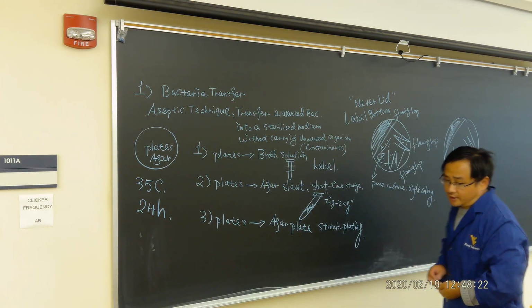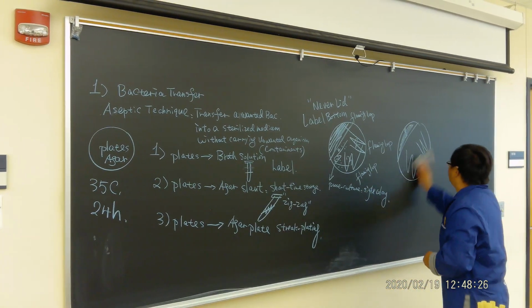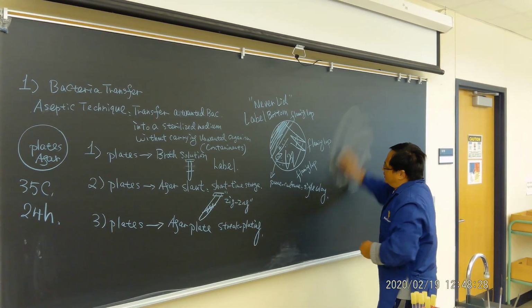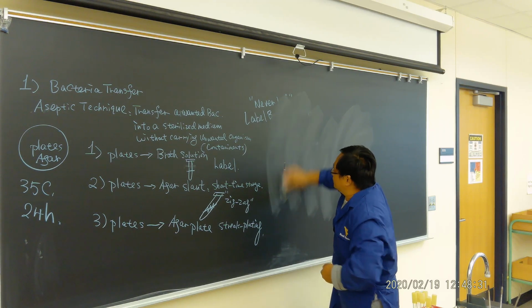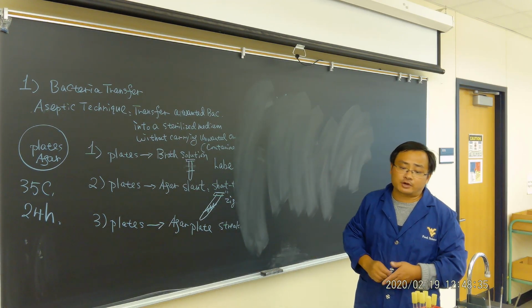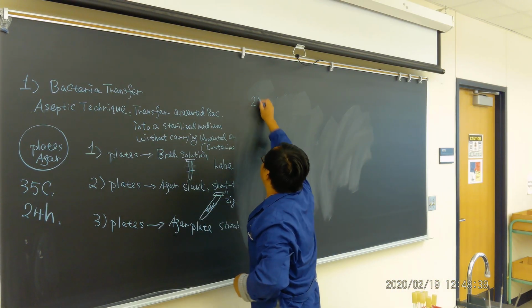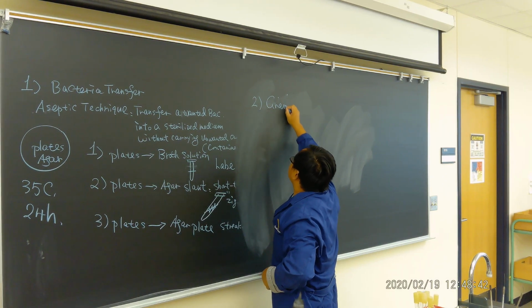Okay, so the second thing is what we were supposed to finish for the Thursday lab. We will skip the simple stain, because the Gram stain covers some steps of the simple stain. So this is the first job. The second job is the Gram stain.